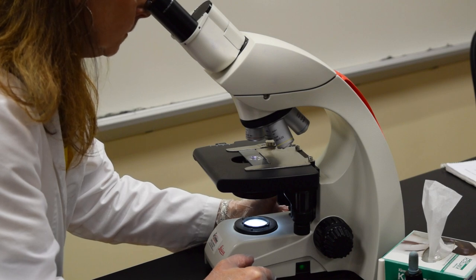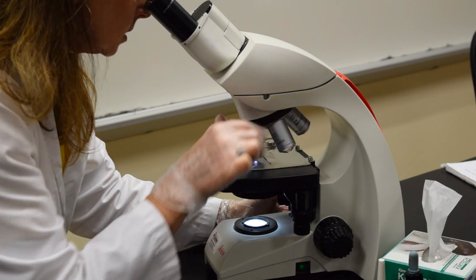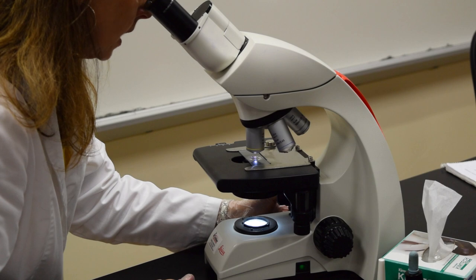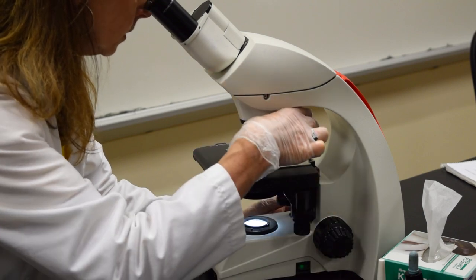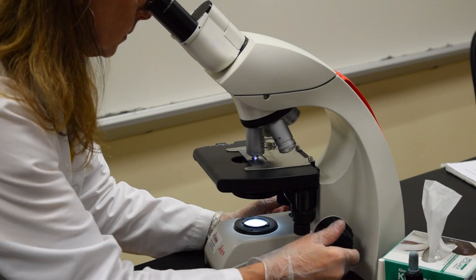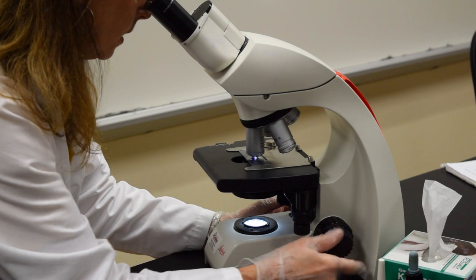After I get the object in focus under scan, I'm going to move the low power lens in place. If I need to focus the slide at this point I'm only going to use the fine adjustment knob. I then move the high power in place. To get it in focus I use the fine adjustment knob.